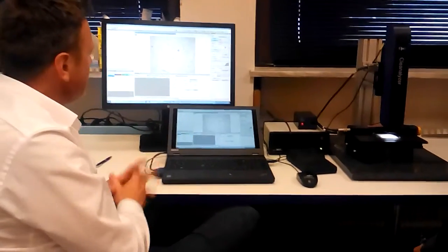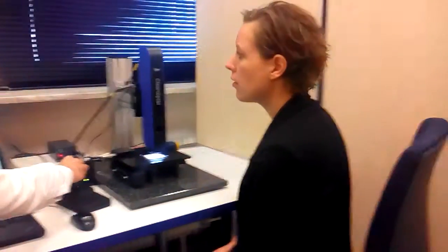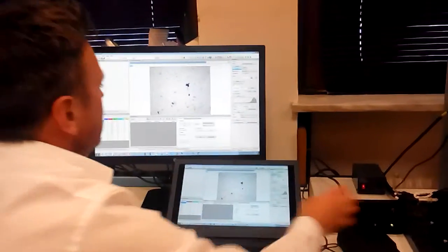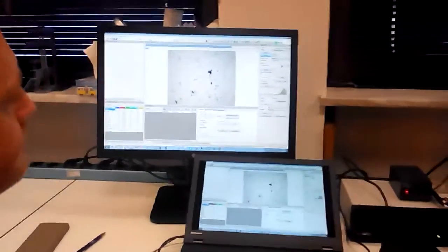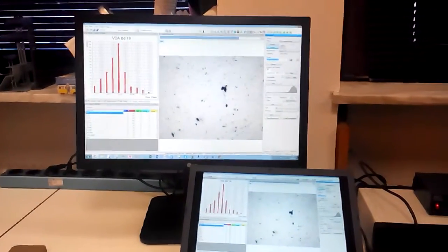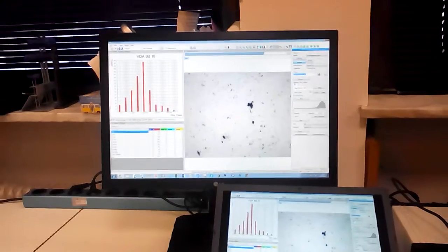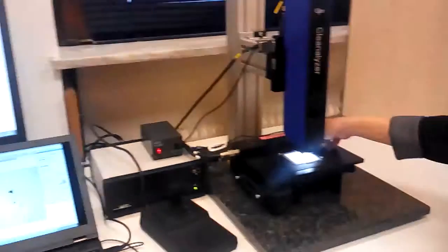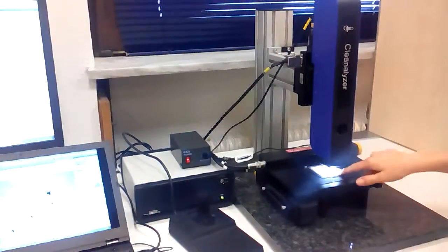So Karen, can you tell us a little bit about the software here? I can see a live view here. I can probably get us into focus a little bit here. Start to bring those in. So to start with the measurement, we first have to choose the right module, the right layout, which was especially designed for having a good view on your sample, on your filter sample, which we can fix with these clamps here.